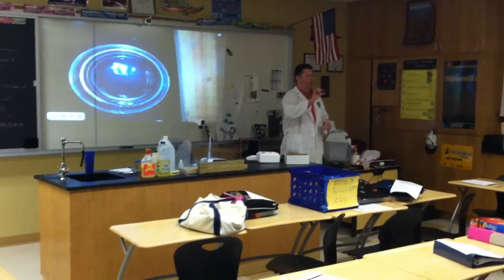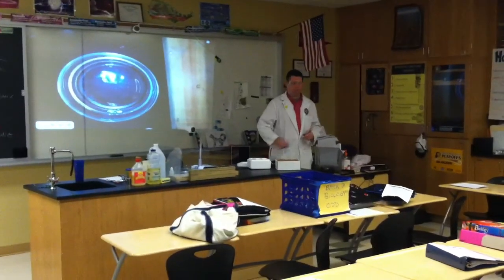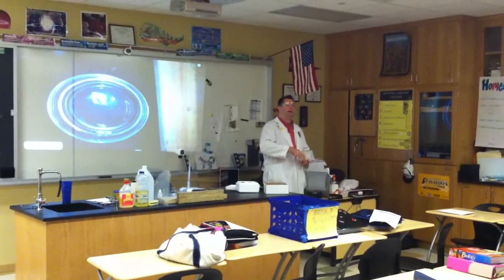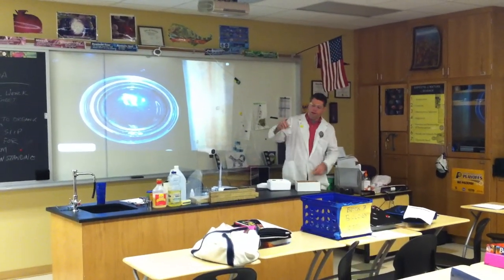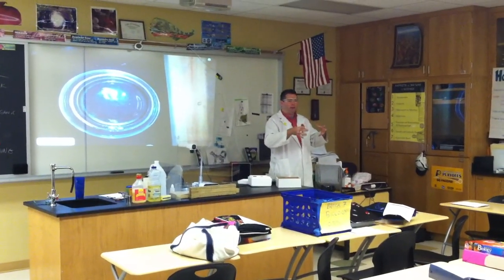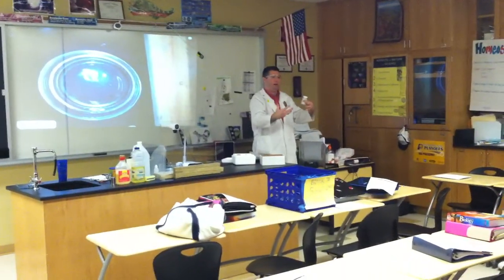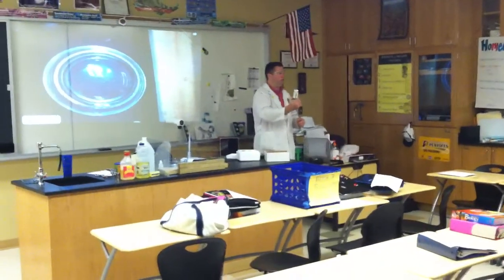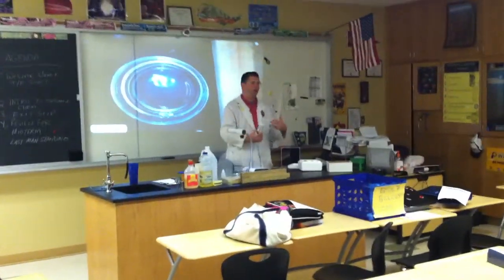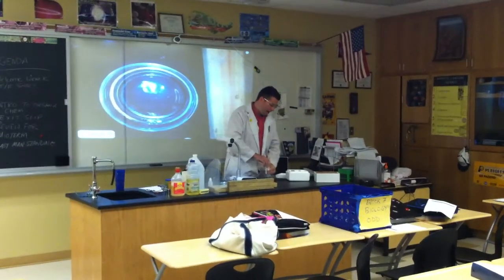Water. So we're going to use small bits, like a small firecracker versus a big, heavy one. To give you guys an idea of how reactive it is, it came in these big metal tins full of clay, and it also came in this plastic bag. It was all sealed in this metal tin. I had to pull it out, and then I have to undo it, and it's still under oil. Right? The oil is to keep it from reacting with the water in the air. So it's so reactive that the moisture in the air will actually cause it to react.